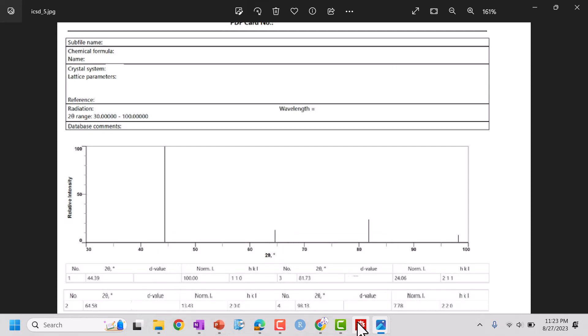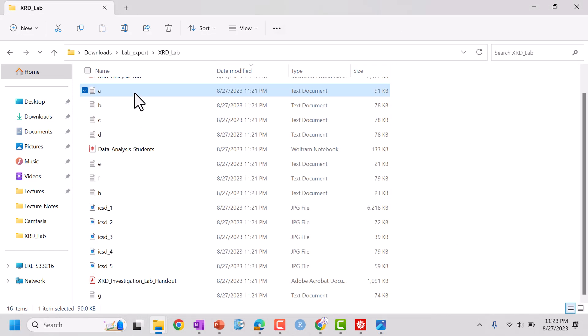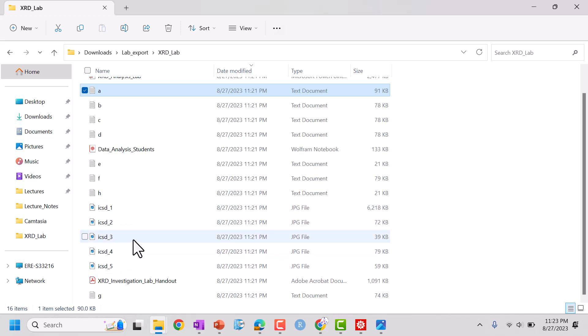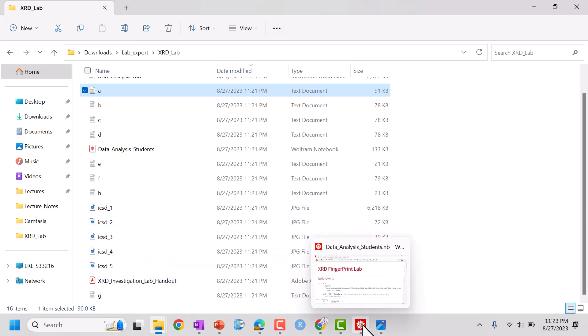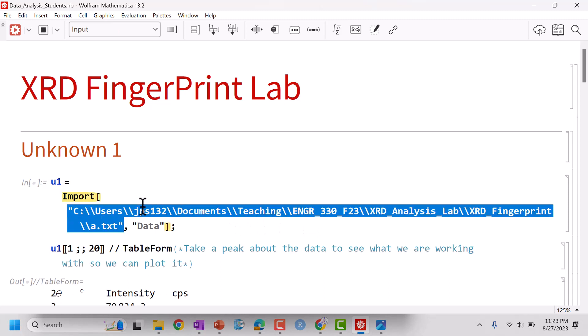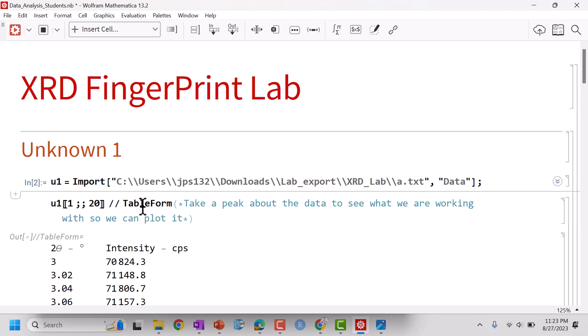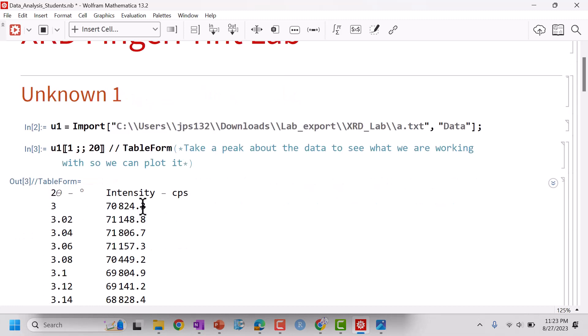Let's start off with an example. First thing I want to do is look at Material A. There's only five so you see we're given more data files than these five materials. These are the five materials that we have to identify. I'm going to go ahead and paste in, control paste this, and I'm going to shift enter and get a sneak peek about this data.